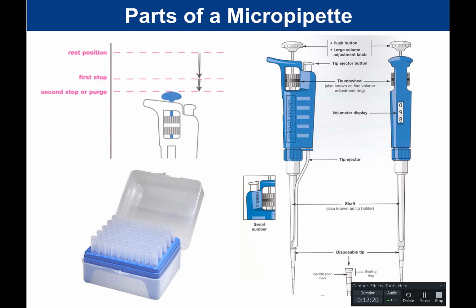Now, the reason that that's important is that when I'm doing my pipetting, the only time I go to the second stop, meaning the only time I'm going to push all the way, is if I am doing what's called the blowout phase, meaning I'm trying to get all the liquid out of the tip. That's the only time that I would go to that point.